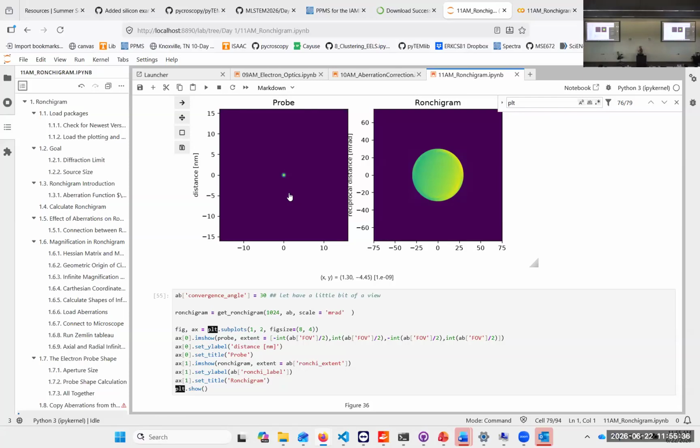Now that we all have gone through that, how would you do that? What is the simplest aberration that we can recognize? The astigmatism. So you introduce a little bit of astigmatism and you see in which direction it smears out, and you know exactly how that is related.